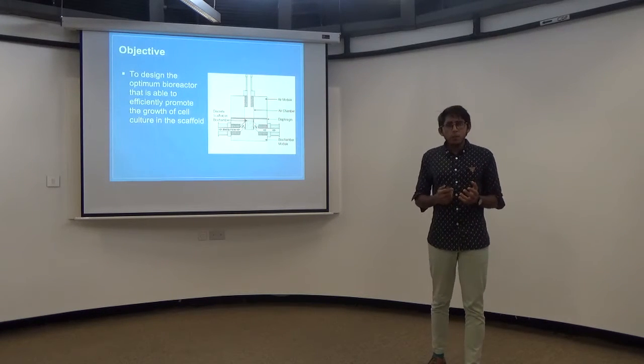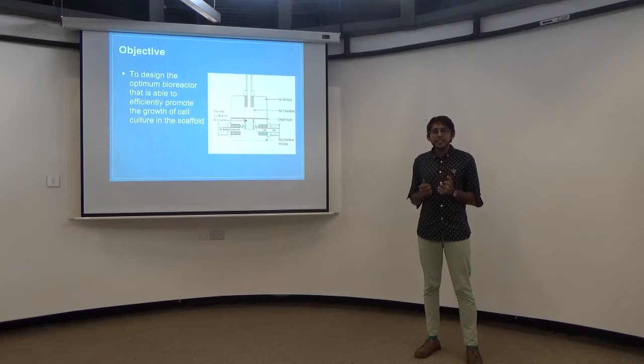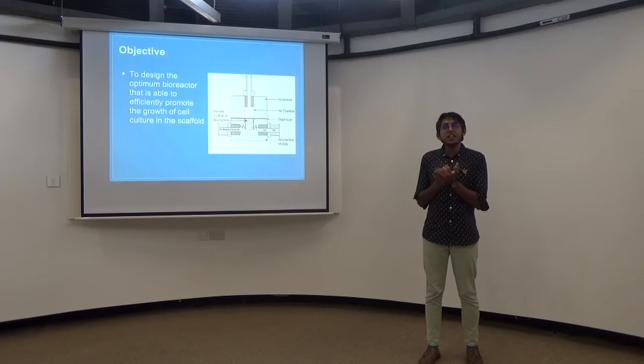So the objective of my project will be to design the optimum bioreactor that is able to efficiently promote the growth of cell culture in the scaffold. So when I say scaffold, I refer to the bed in which the cell cultures can actually grow and flourish.